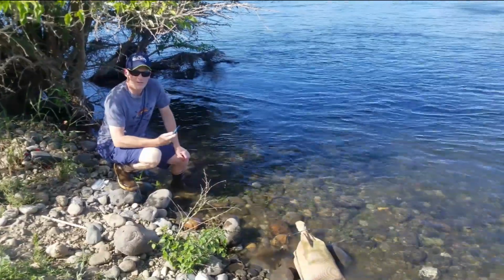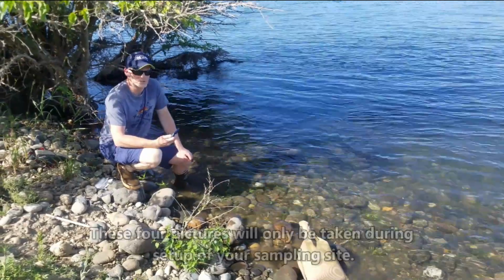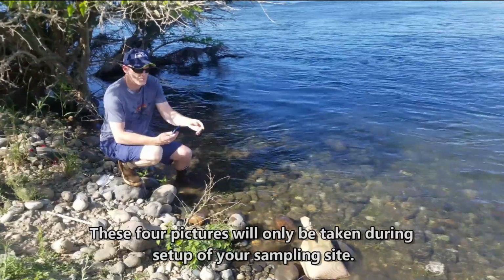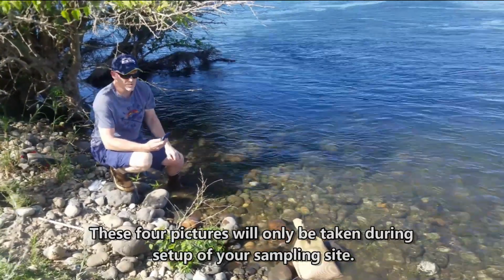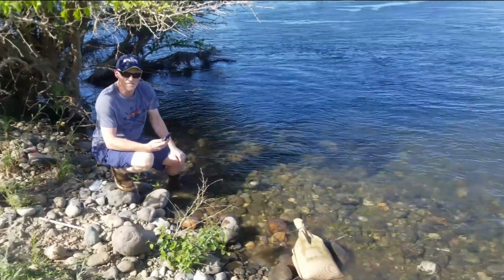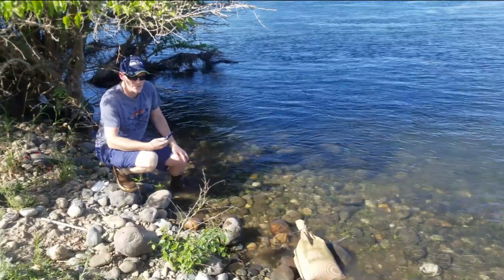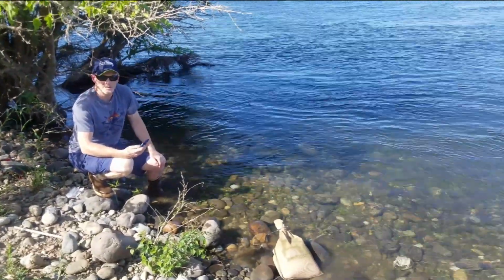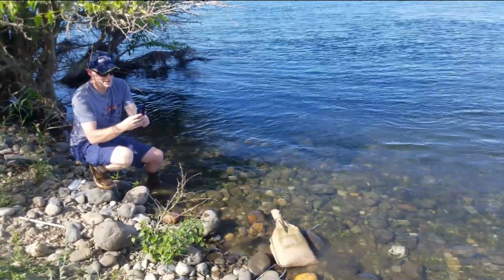After you've got your tube secured, next thing to do is to take pictures of your site. You want to take 4 pictures, one facing downstream where you can see sediments and vegetation and water, one looking upstream, also seeing water, sediments, and vegetation, one up close where you can see sediments, and then one looking across the river to see the broader landscape. You want to have a tape measure out to 30 centimeters in these pictures so you get a sense of scale. So I'll take these now.